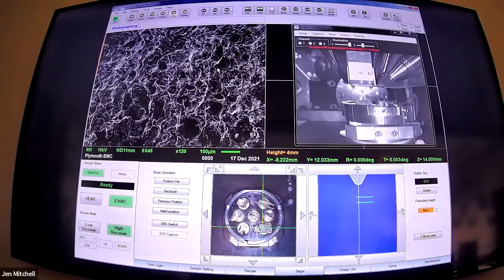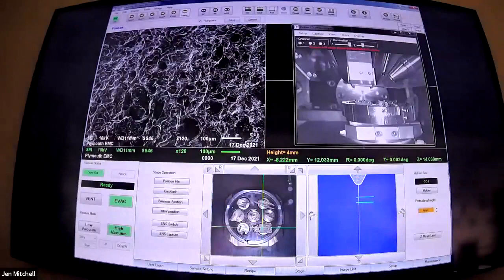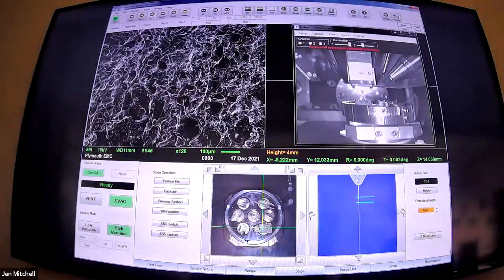You have little pockets with your orange oils in there, which you can just see at the interface. This is quite a different texture to the inside of the orange - when you're peeling an orange, that pithy bit can get quite stringy and fibrous. It's quite dense but still very spongy in there. The juice vesicles - little pockets. Oil sacks, now sadly devoid of that lovely orange oil. It's got this really fine mesh network still.